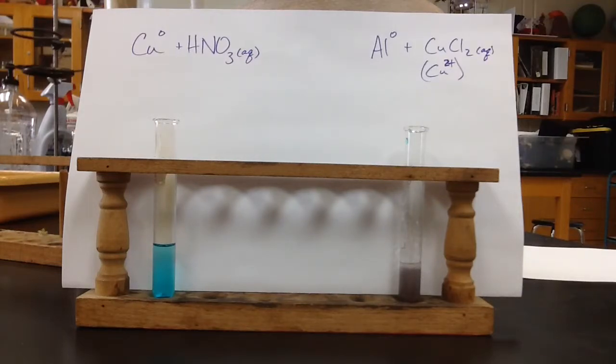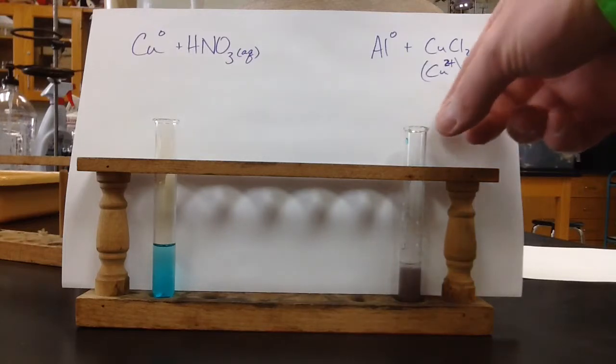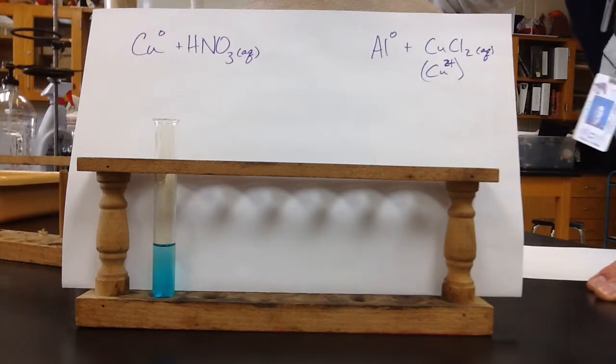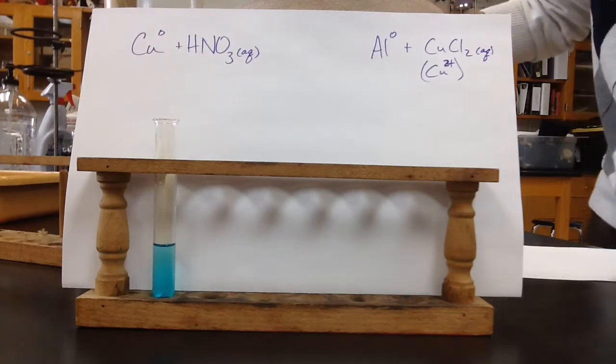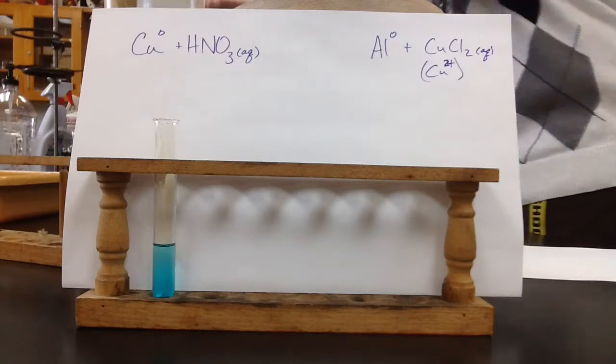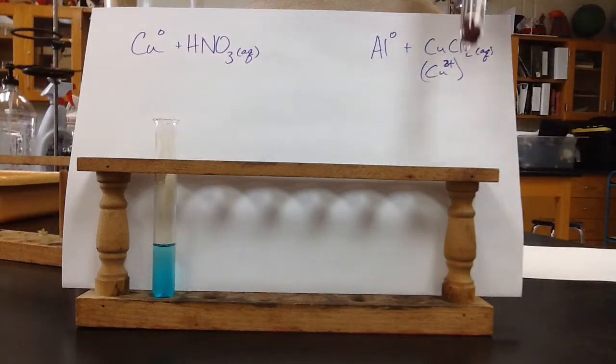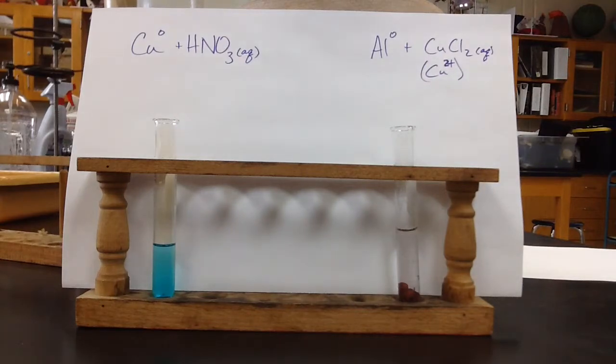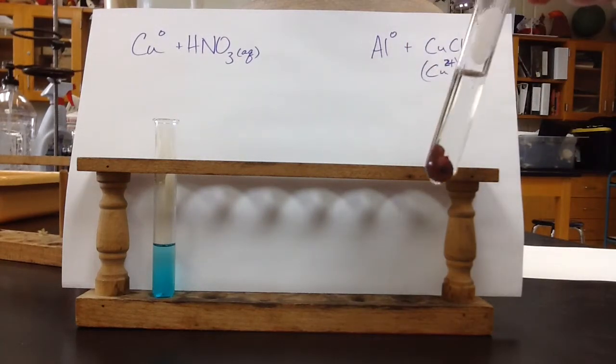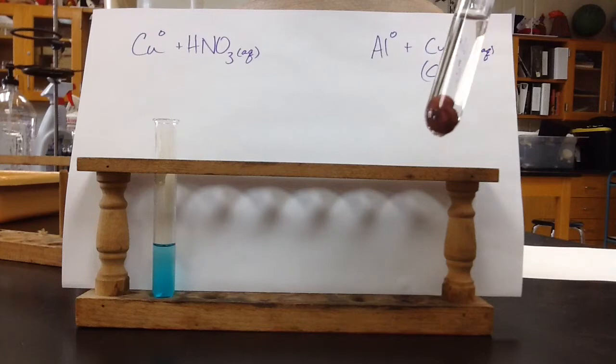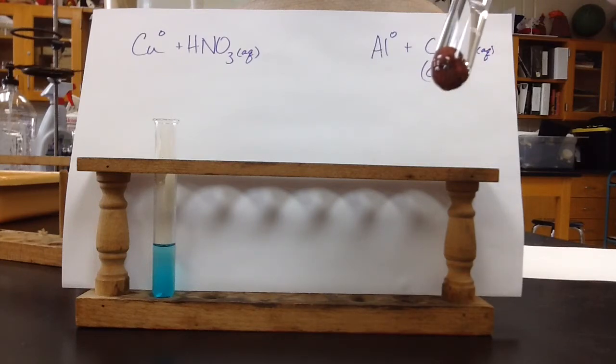This will probably keep reacting for a little while longer. So what I'm going to do is just pour off the liquid there so we can see the copper that formed. So we can see, I'm going to bring you a little closer to the camera here. Hopefully you can tell the color. In person, this is a really nice kind of brown color, and that's your copper that formed in this reaction.